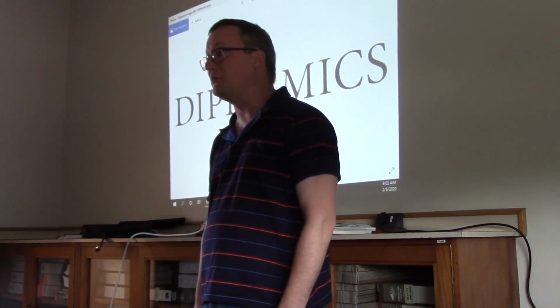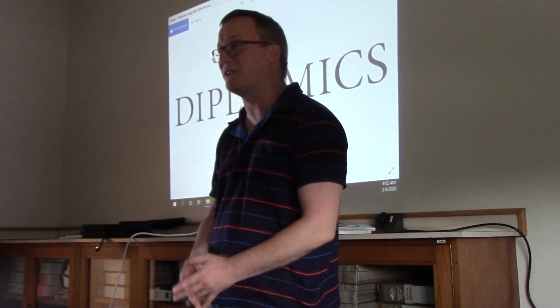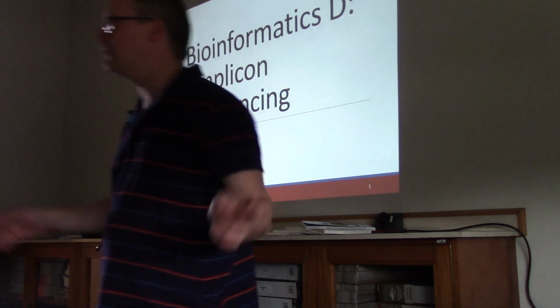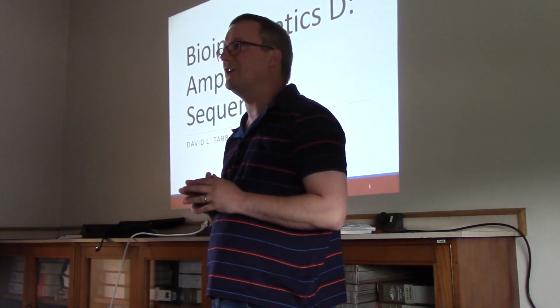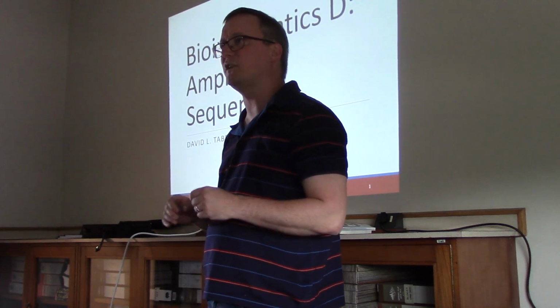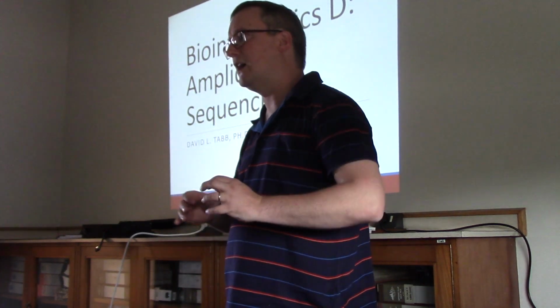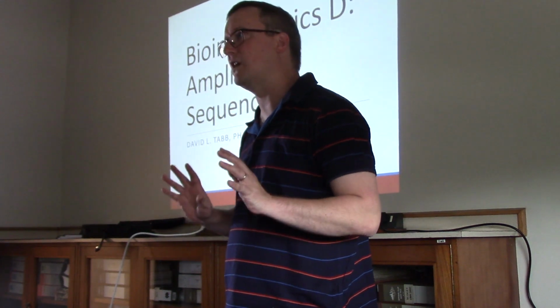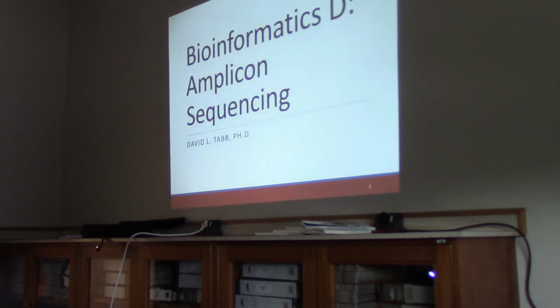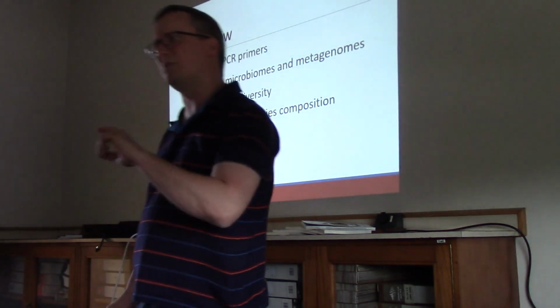I am really thrilled to be back with you to return to the fine topic of sequencing. But today, instead of talking about assembly and annotation and stuff like that, we're going to be talking about amplicon sequencing. Because there are quite a few tasks specific to PCR-based methods that I think have bioinformatic capabilities of their own that we should talk about. So that's today's emphasis. I think this will be a relatively short lecture.